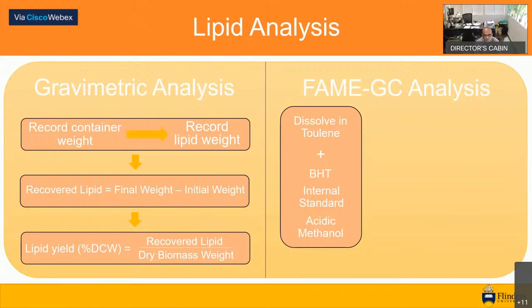proceeds. The next day, the FAMEs undergo a cleaning procedure to remove impurities which may affect detection by the gas chromatograph. This begins with the addition of a 5% sodium chloride solution. This is then transferred into a separate test tube for extraction of FAMEs into hexanes.